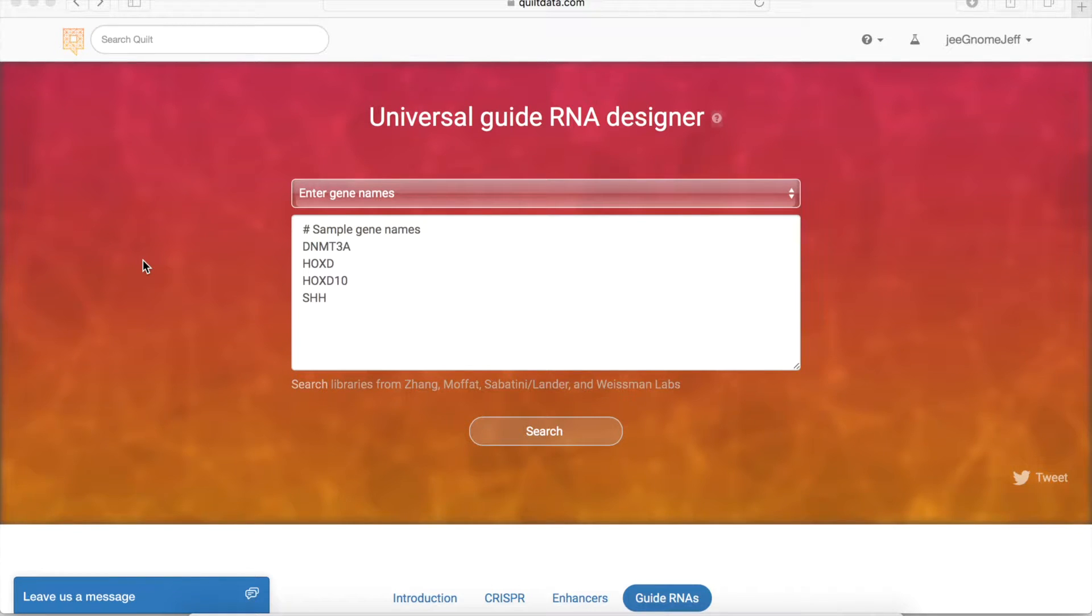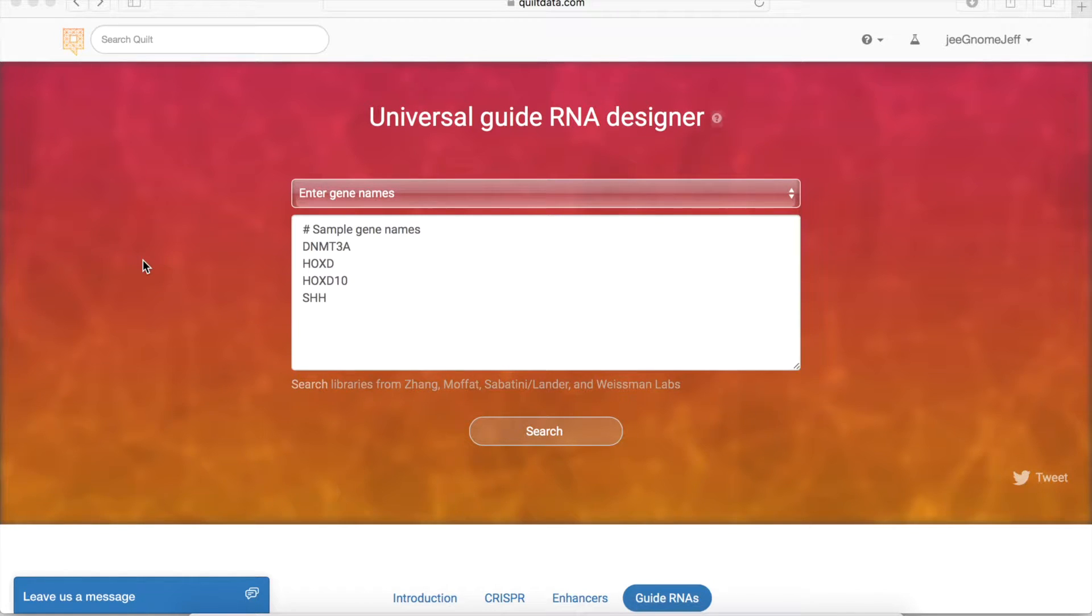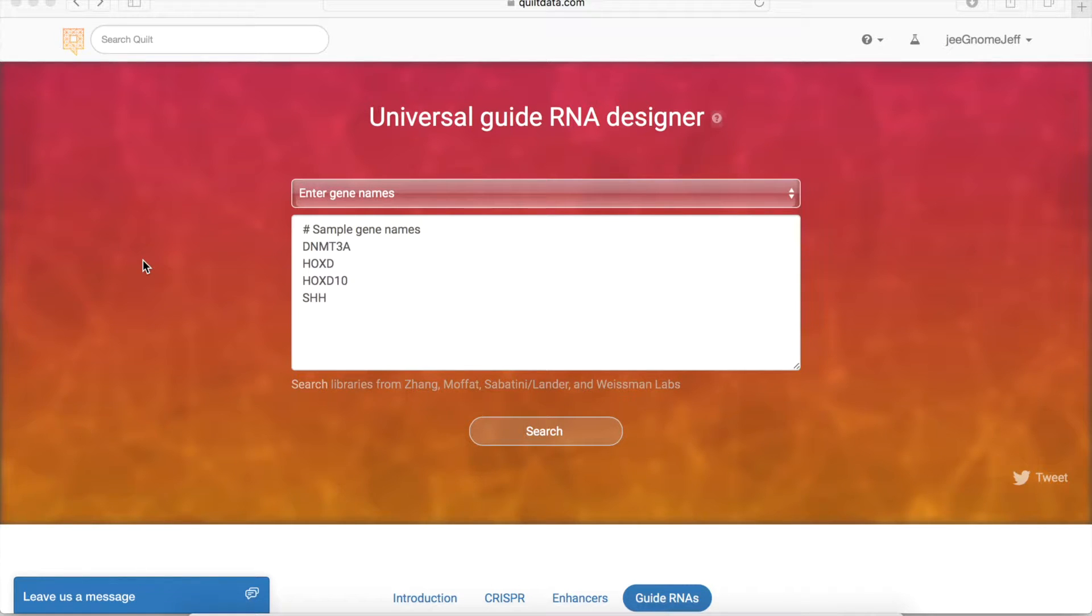We don't think you should have to reinvent the wheel every time you need to design a guide RNA, because world-leading labs in CRISPR technology have already designed and optimized entire genome-wide CRISPR libraries. So that's where we start.